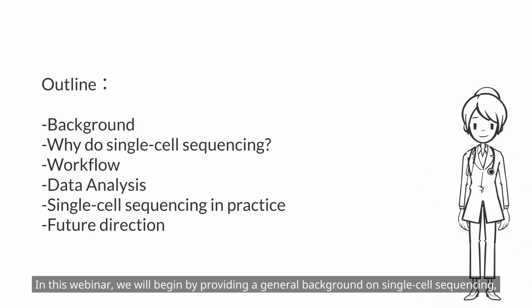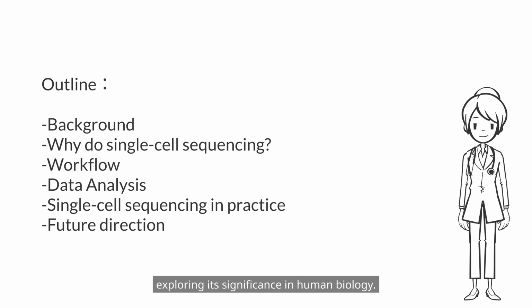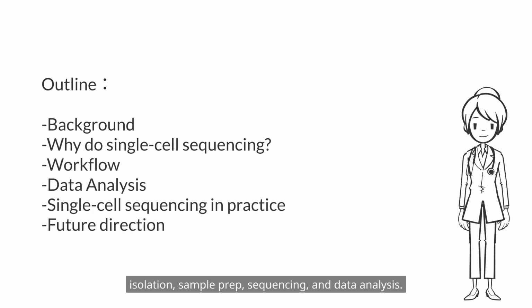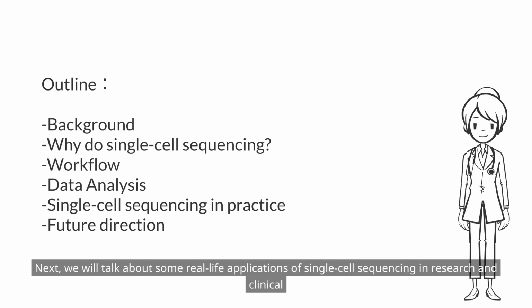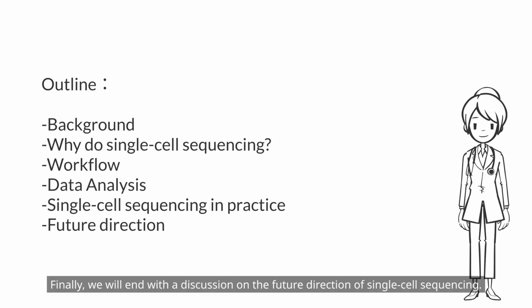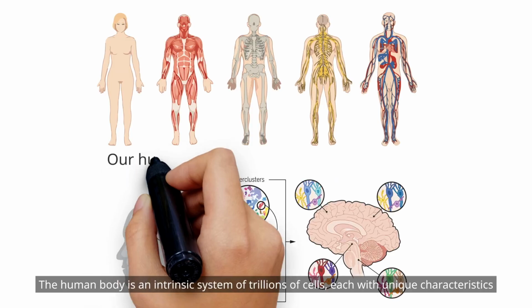In this webinar, we will begin by providing a general background on single-cell sequencing, exploring its significance in human biology. We will then walk you through the workflow of single-cell sequencing, including single-cell isolation, sample prep, sequencing, and data analysis. Next, we will talk about some real-life applications of single-cell sequencing in research and clinical practice. Finally, we will end with a discussion on the future direction of single-cell sequencing.